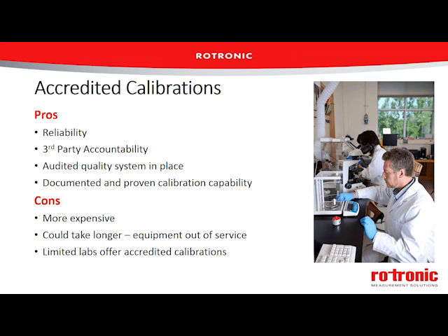On the con side, typically laboratories will charge more for the accredited calibration because it is more work for them quite often, and they have to go through these third-party audits. So that takes time and costs them extra money as well. Potentially the service can take longer. Sometimes that extra time though is worthwhile. The accreditation ensures that the calibration process is happening using best practices. So sometimes it's better for it to take longer because you know it's being done well.